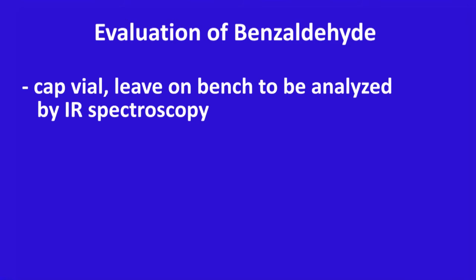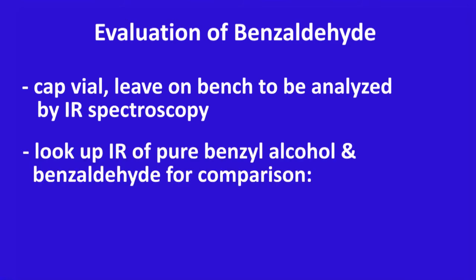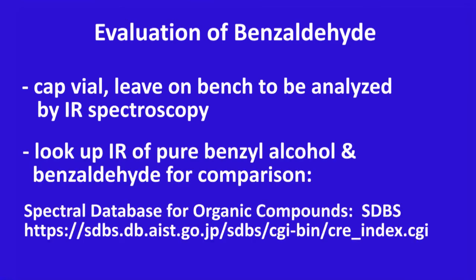Use the Spectral Database for Organic Compounds, SDBS, to look up IR spectra of pure benzyl alcohol and pure benzaldehyde and compare them to the IR spectrum of your product. Complete the post-lab assignment.